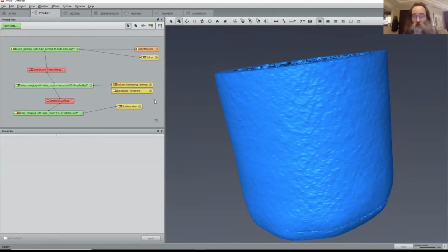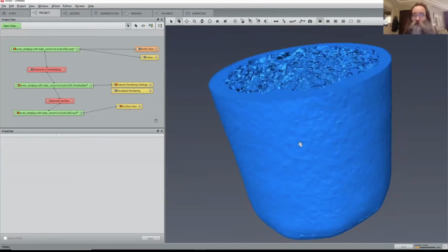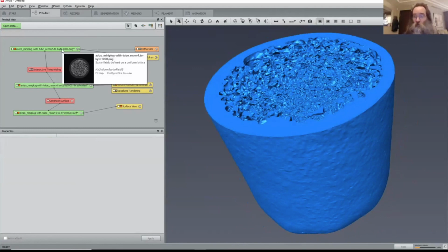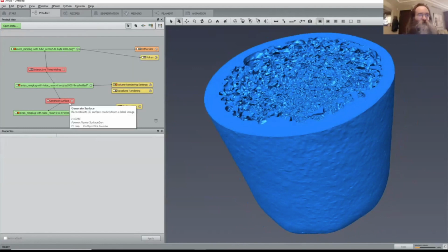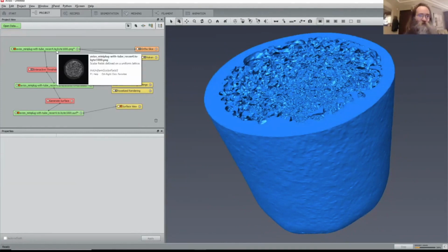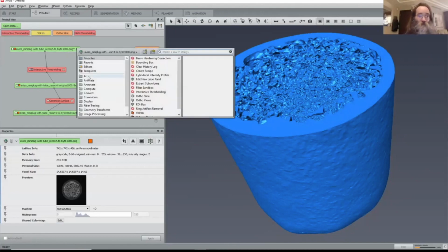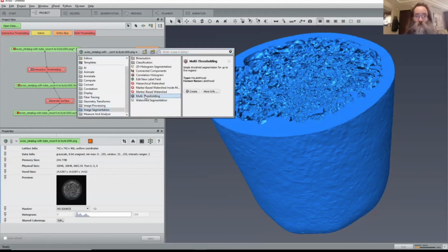Okay. Now we had three different objects in there. We also had two different kinds of rocks. So if you want to look at all of them, you could do another interactive thresholding on this and generate the rocks only. But there's an easier and faster way to do that in one step, and this is called the interactive thresholding, multi-thresholding. It's again in segmentation, and it's also actually already here, multi-thresholding.